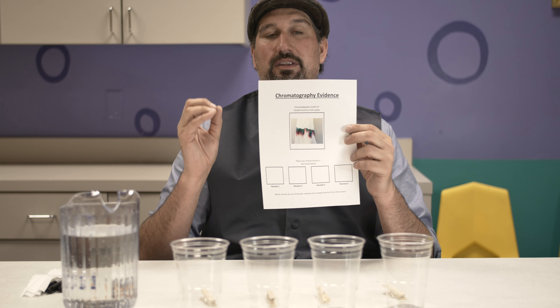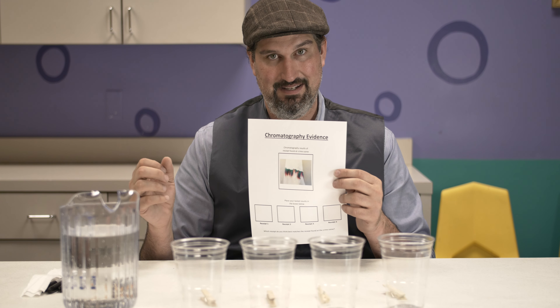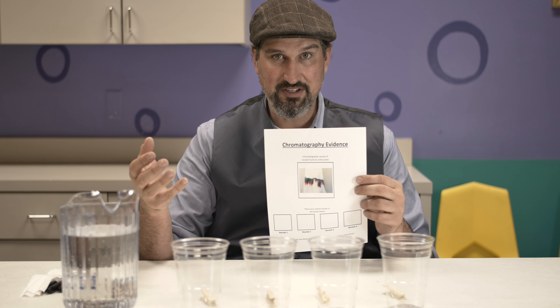At the end of this one, you're going to see one of the problems of forensic science, and I'm not going to tell you until the end. So for now, let's just see how we're going to do the experiment.